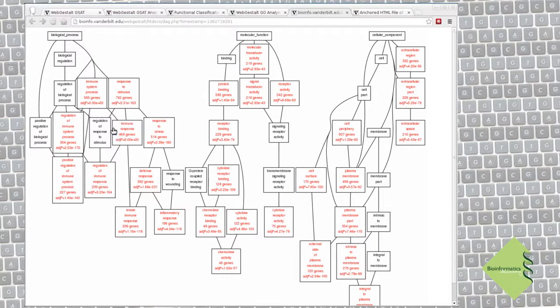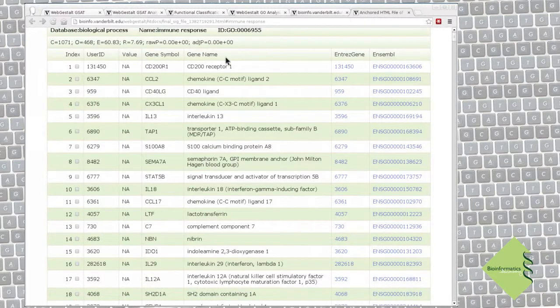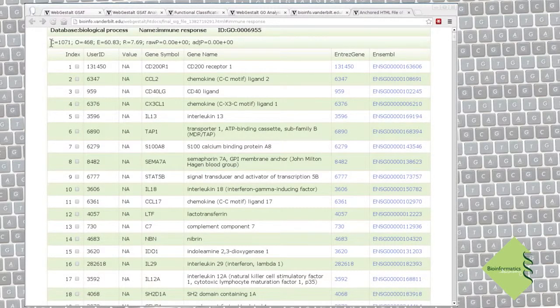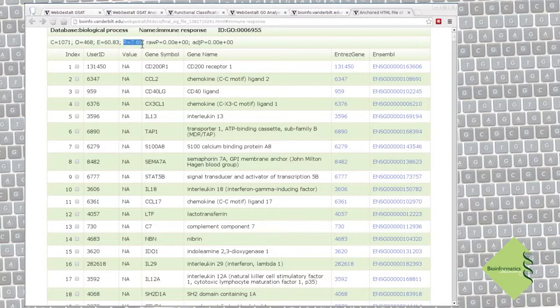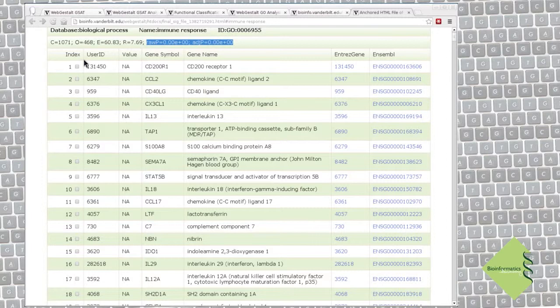We see that there are 468 genes. Clicking on the term, we can see the detailed statistics. Here are the number of such genes in the entire genome, and here are in our set. This is the expected number in a random set with the same size as our target gene list. This is the enrichment ratio. We can see the raw and adjusted p-value, which are rather convincing here.